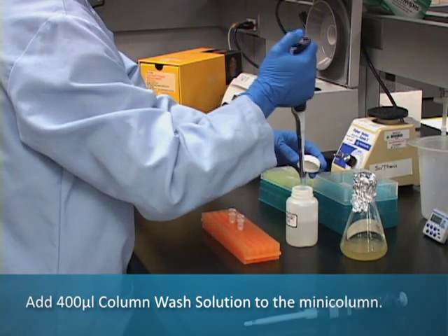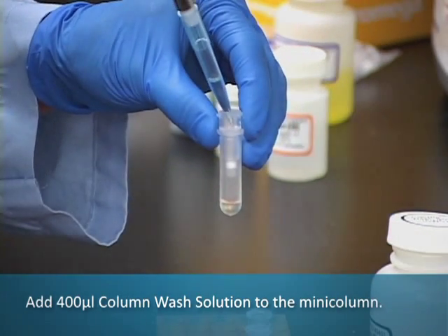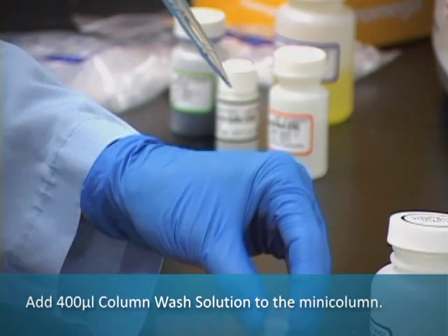Following centrifugation, add 400 microliters of column wash solution to the Mini-Column and centrifuge at maximum speed for 30 seconds.